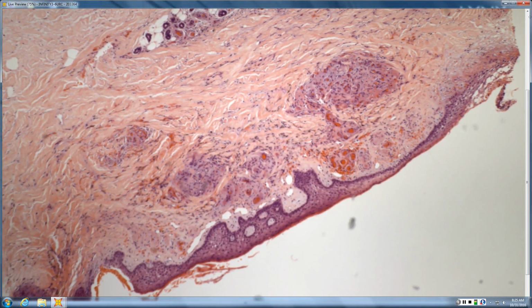But those lumens, a lot of these are like one erythrocyte wide. They're these puny little lumens. And the rest of it is amphophilic? That's vessel wall. So you've got that big hyalinized amphophilic vessel wall, tiny little lumen, nodular angioplasia, and fibrin thrombi. That's livedoid vasculopathy.